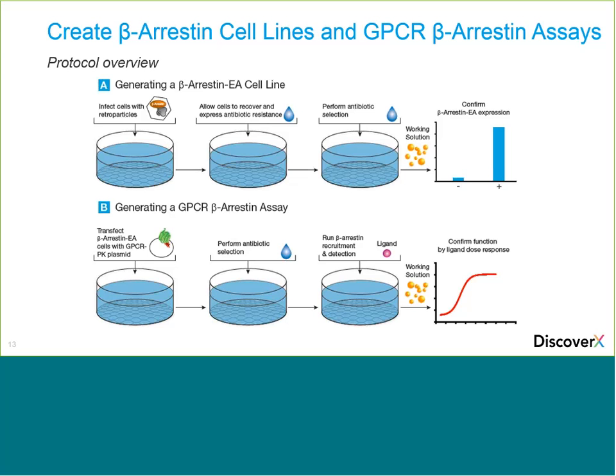So very desirable qualities. I got a question related to why not just use a plasmid-based system? Well, we chose to do kind of a combination approach, and we felt that retroviruses have up to 90% efficiency compared to plasmid transfections, which is typically around 20%, for instance, doing electroporation. In general, they're more favorable: faster, more efficient, and stable.